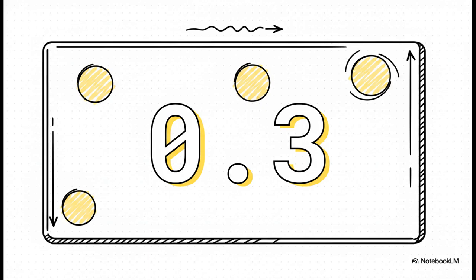Because of this built-in deceleration, the resolution between two spots on your plate depends enormously on their RF values. According to the data, resolution actually hits its maximum for an RF value of about 0.3. If the RF is too high, the spots have traveled too far with that slowing solvent and they start to diffuse. If it's too low, they just haven't separated enough yet. So, 0.3, that is your mathematical sweet spot for clarity.